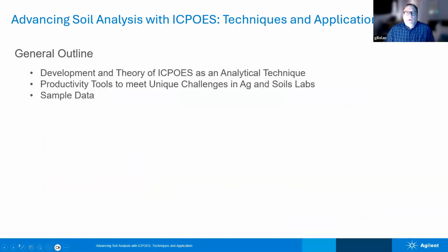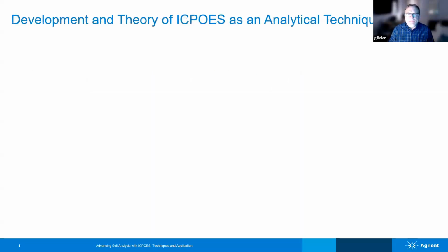In terms of what we're going to cover, I'd like to talk about the development and theory of the ICP-OES as an analytical technique. I'll show you some productivity tools on the instrument or in the software that address some of the challenges of ag and soil labs. And then I'll show you some example data. I can't show you everything. I tried to fit some gigantic tables on slides, and it didn't work, and I don't want to give you an eye chart to look at. So let's jump into development and theory.